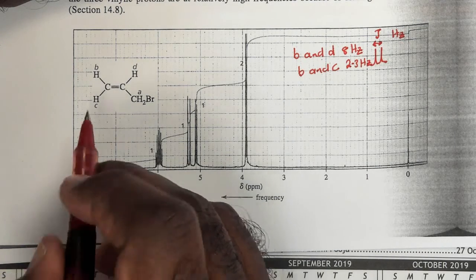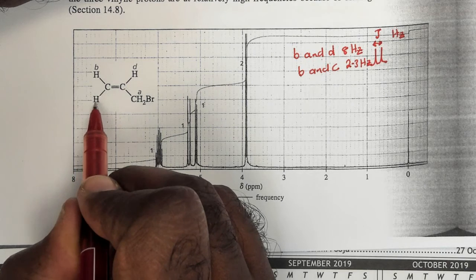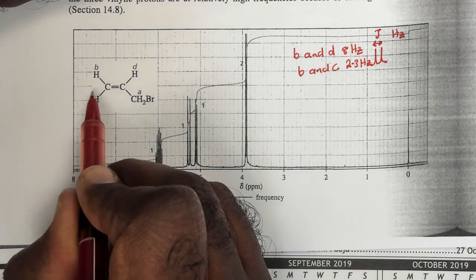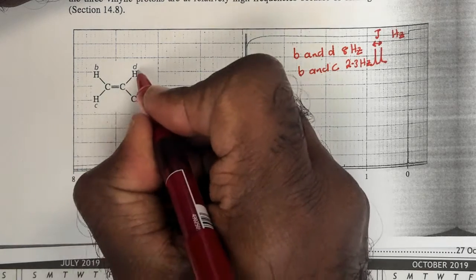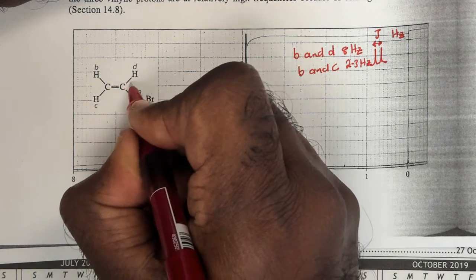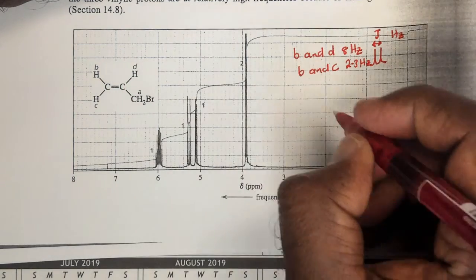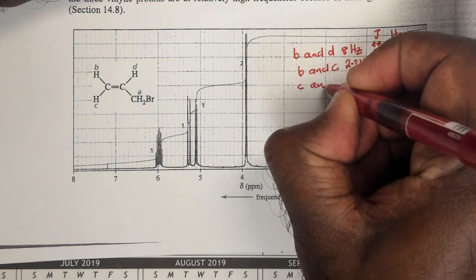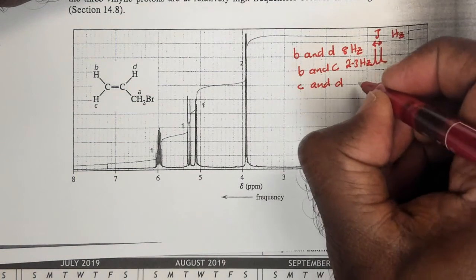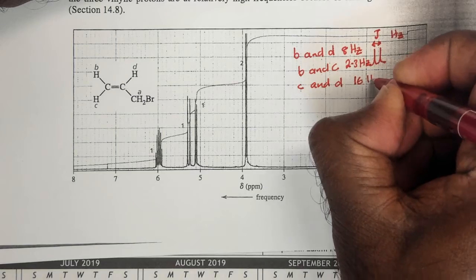So we get two types of coupling here, cis coupling and a geminal coupling. We also get a coupling between these two protons, C and D, and that's trans to each other. So C and D, the coupling constant here is around 16 Hertz.